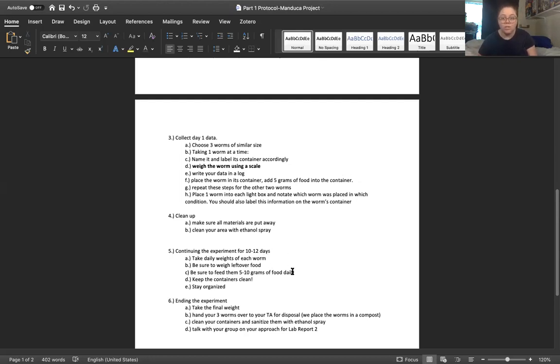So this is more data that you can collect. When you're growing, you tend to eat a lot, right? So that correlates to your experiment. You can also create a line graph or a bar chart or a histogram based on how much food was eaten or how much food was left over. And then you would weigh Mary to see what her growth was, right? So if she started off at 3.2, maybe today she's 3.6, she grew 0.3 grams in 24 hours. So you would tackle this kind of data as well.